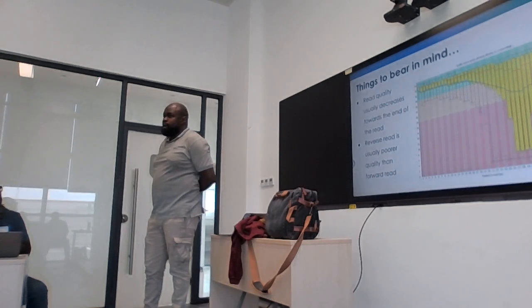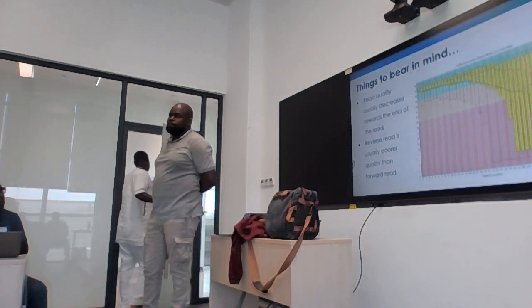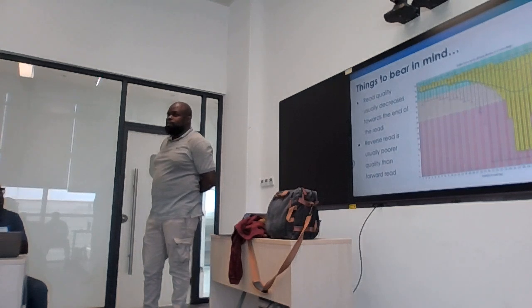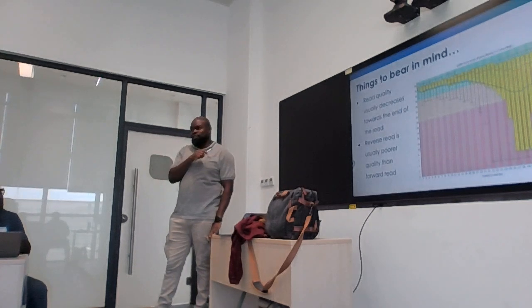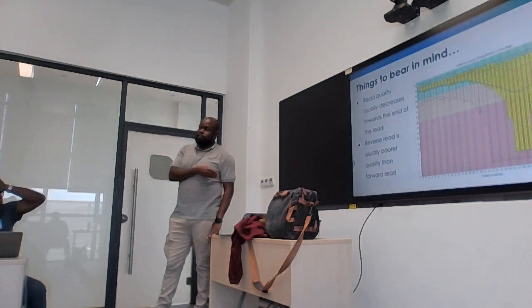Well, at least for most tiled amplicons, you expect lots of overlap, correct? So you're right. Generally, this is what we expect where you have tiled amplicon sequencing, and some degree of overlap is expected. But if the insert size is pretty long and there's very little overlap, that goes back to what you were saying, that you have to have reasonable expectations based on the technical conditions in which you're sequencing.